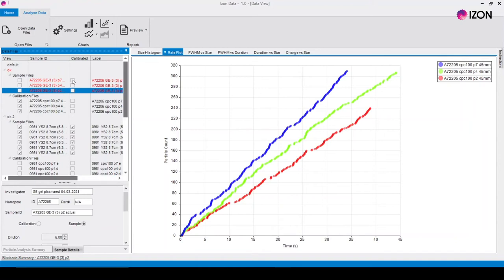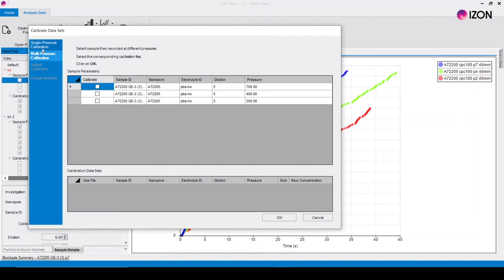To calibrate a sample measurement click on the check box in the calibrated column next to the sample you wish to calibrate. This will bring up the calibration menu. Check the multi-pressure calibration is selected in the menu on the left.